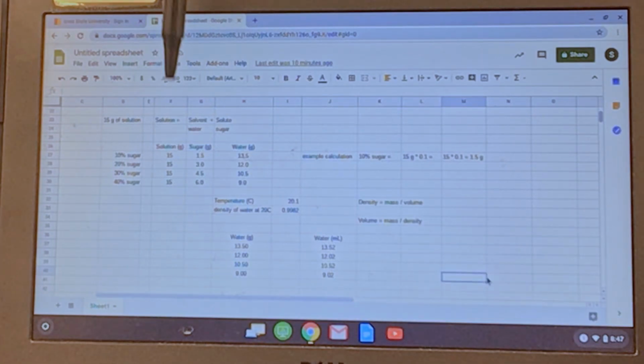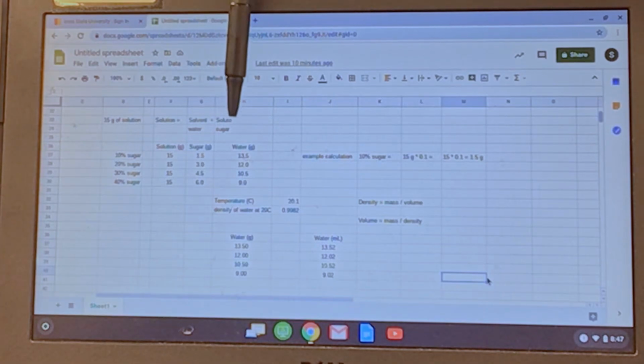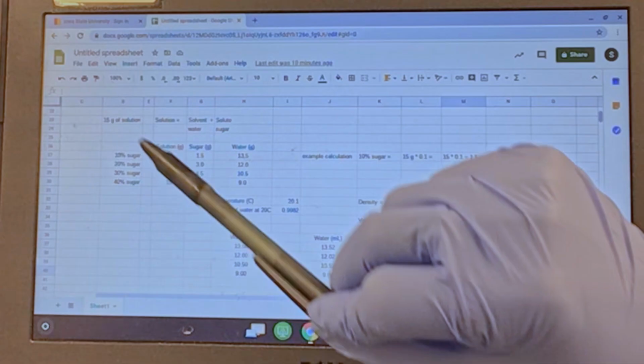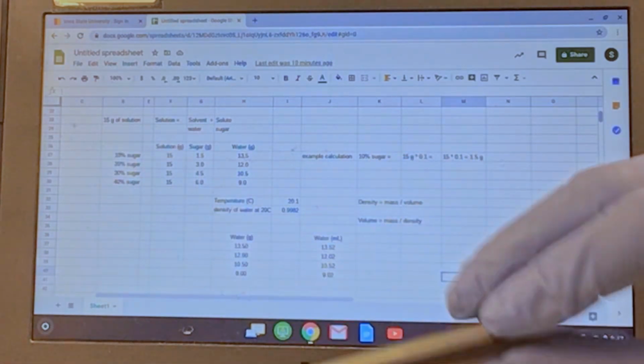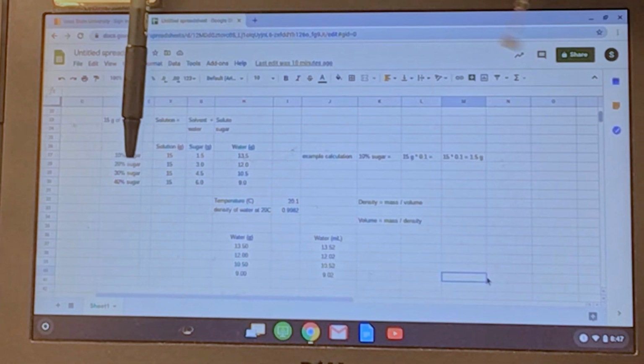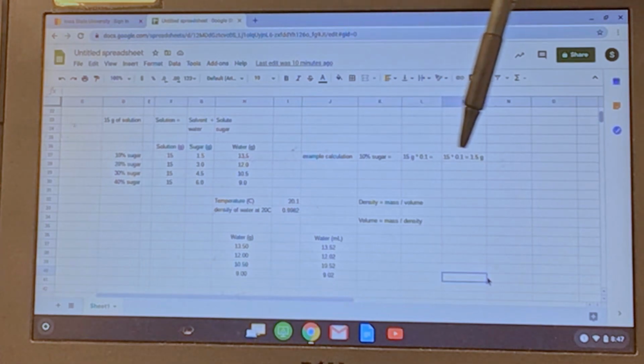So as I said, the solution is made by a solvent, water in our case, plus a solute, sugar in our case. So in my case, I wanted to prepare 3 solutions. I have an example for 4 solutions, but I'm gonna make only 3 of those. So 10% sugar, 20% sugar, 30% sugar. This is an example calculation.